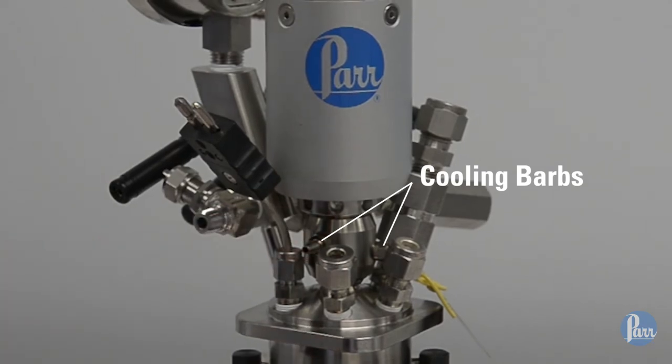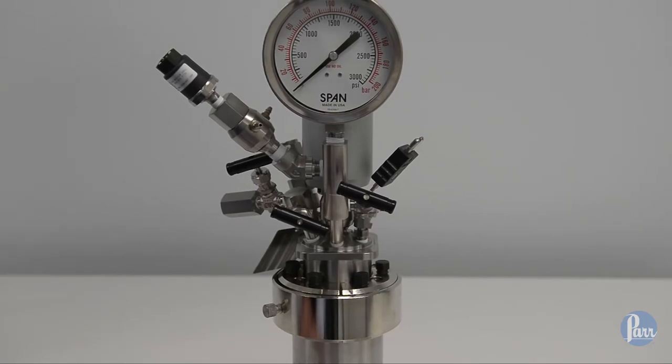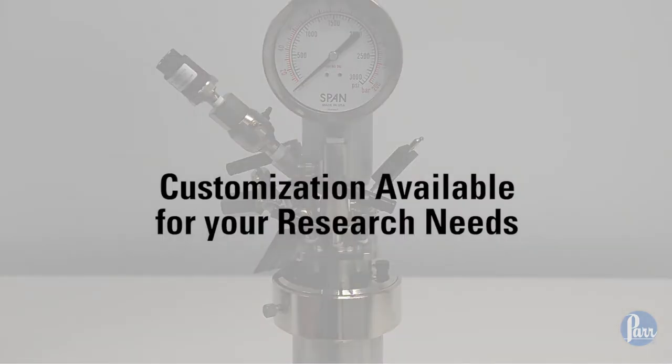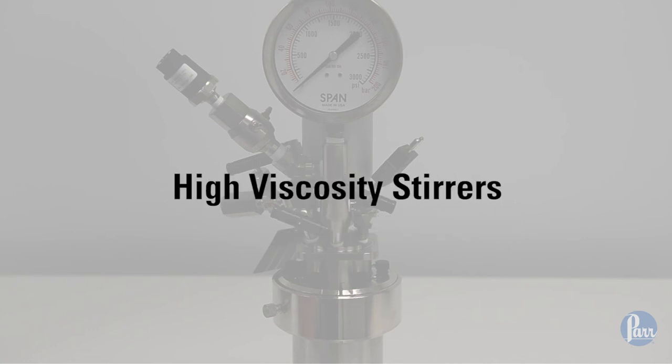But we're happy to customize it to meet your research needs. Whether you need special openings in the head or cylinder, high viscosity stirrers, windows, special valves, heaters or jackets, explosion-proof wiring, or a different volume, just ask.